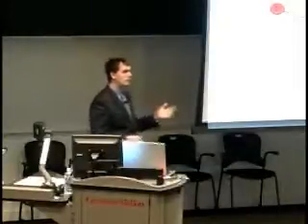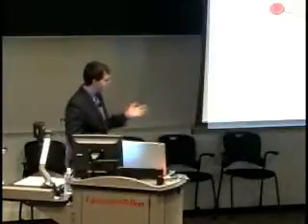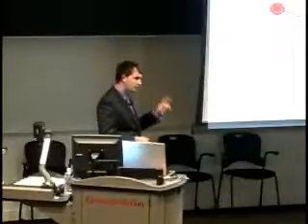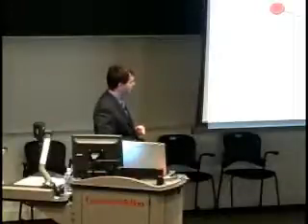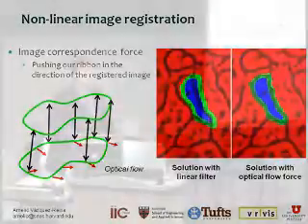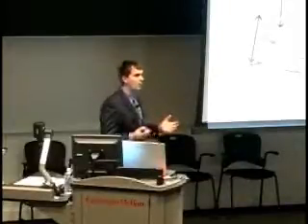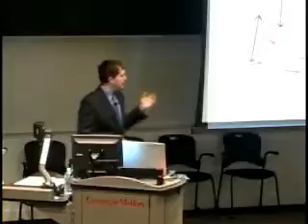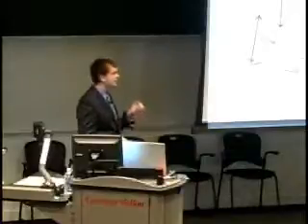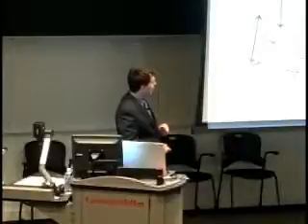Then, in order to compensate for any misalignments in the data or any non-linearities in the motion of cross-sections, we also apply nonlinear image registration for every two adjacent cross-sections using optical flow. We can look at optical flow as another force field that is acting on our deformable ribbons, and they push the ribbon towards the registered images. The good news is that optical flow is a very spatially coherent operation, which means it can be easily optimized in a GPU.